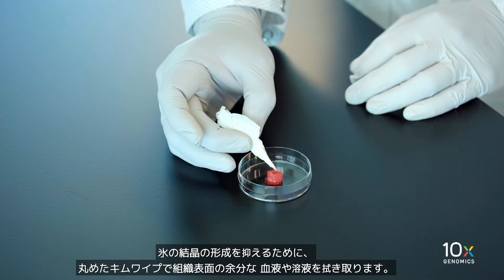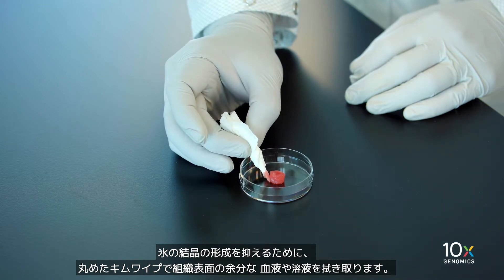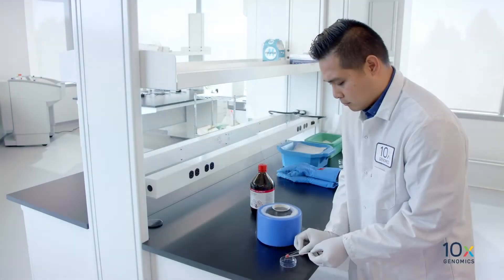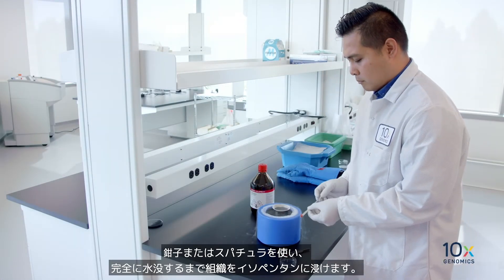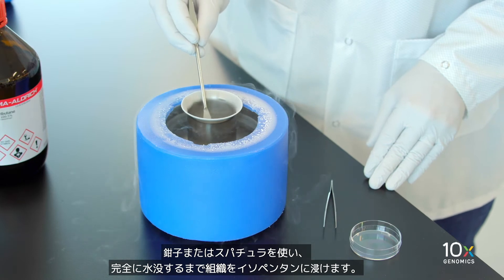Next, we will prepare the fresh tissue. Using a rolled up laboratory wipe, absorb excess blood or solution from the surface of the tissue to limit ice crystal formation. Using either a forcep or spatula, lower the tissue into the isopentane until fully submerged.